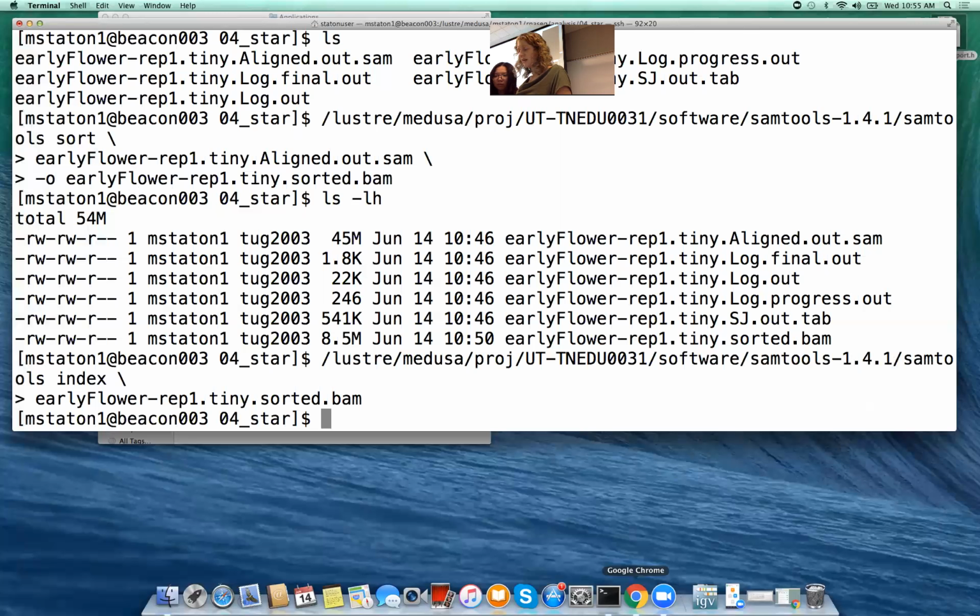All right, so that file works. When we process the whole library, for some reason that one shows up and our itty bitty tiny file does not show up. I'm not 100% sure if I'm just not going to the right places to see the reads for the tiny file. So it looks like for the tiny file, you just have to kind of hunt around to find your reads. When we load a big file, you can see lots of reads.